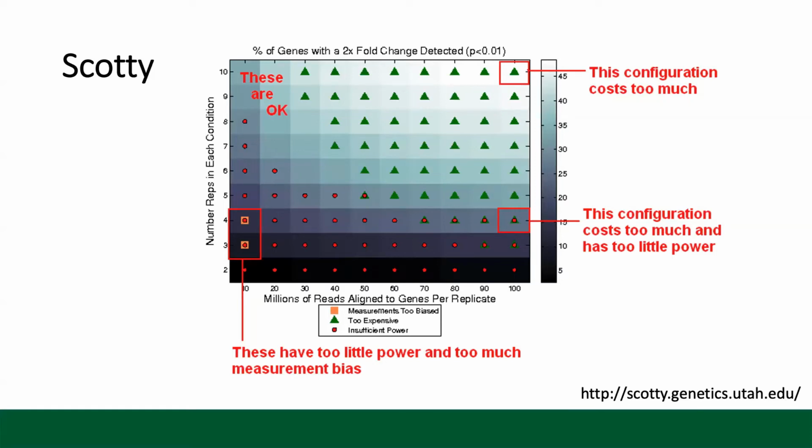Basically, it's a really cool online program that's free, and it just pulls in your example data set and then any parameters that you want to give it, whether that's the effect size that you think you'll see or how much money you're willing to spend on your experiment.